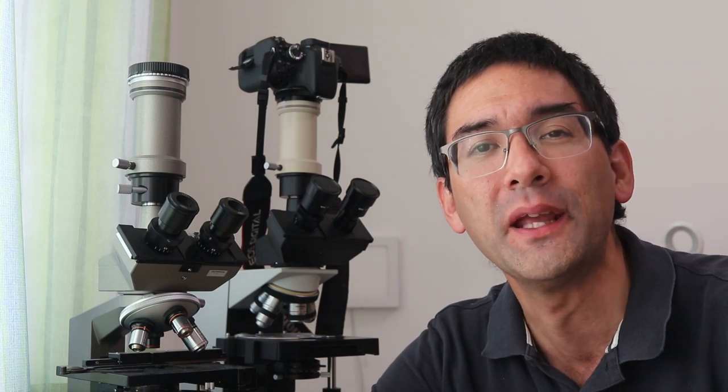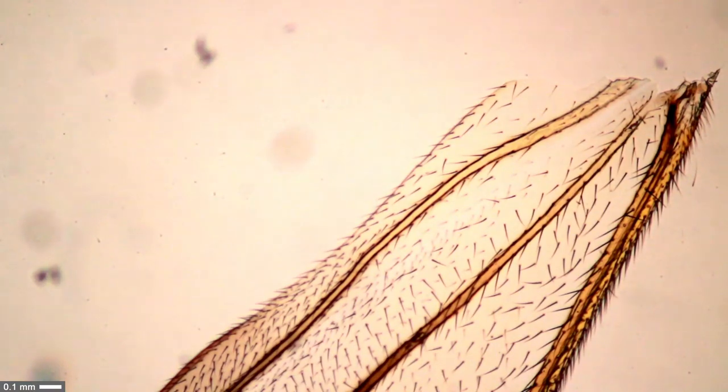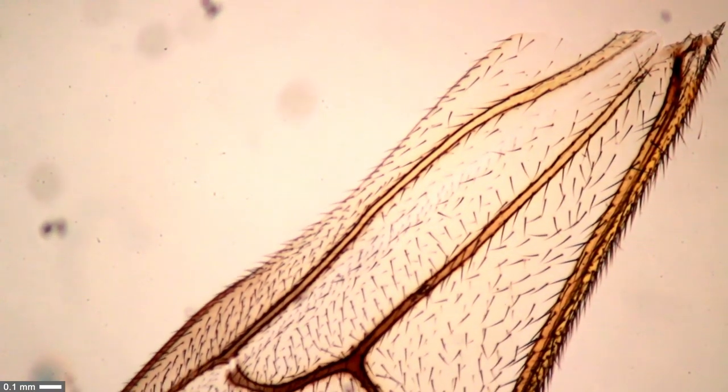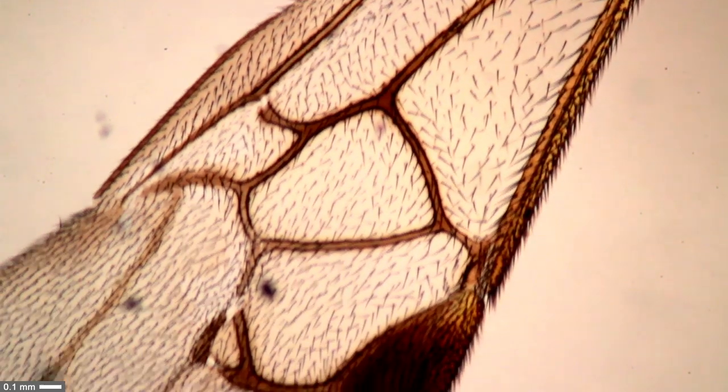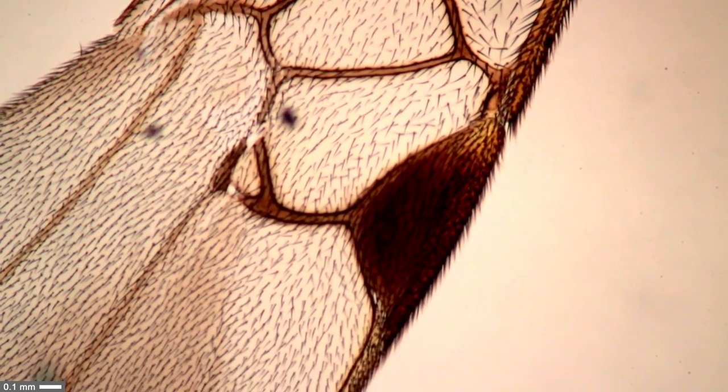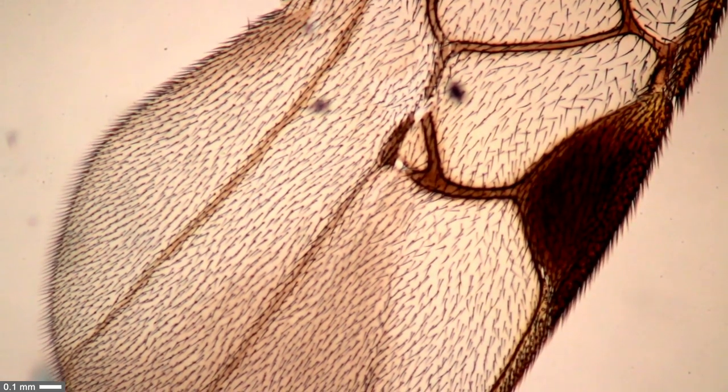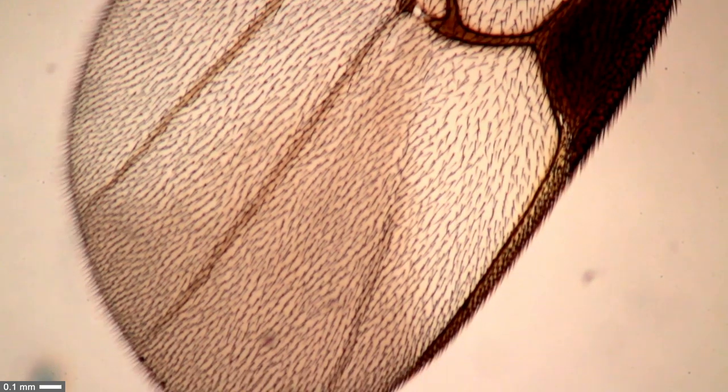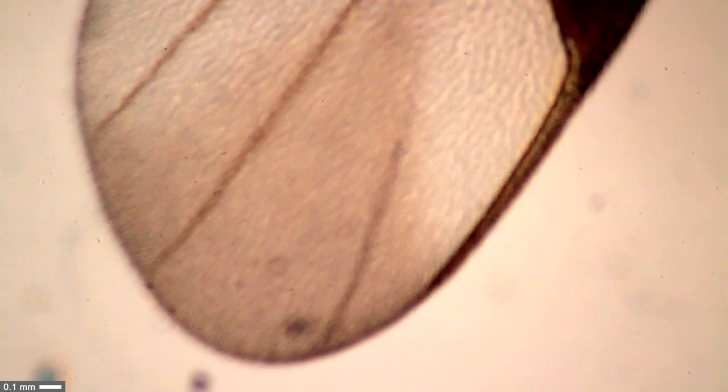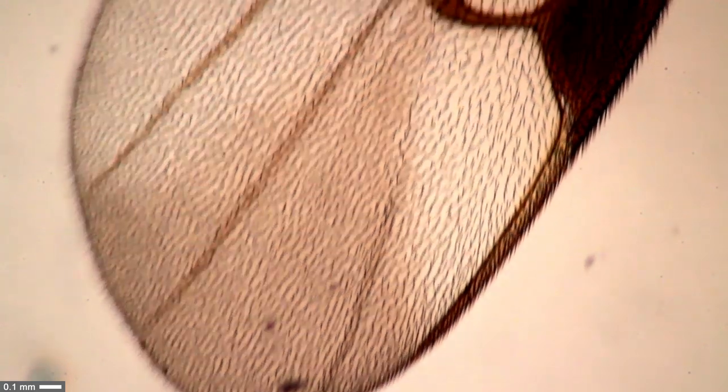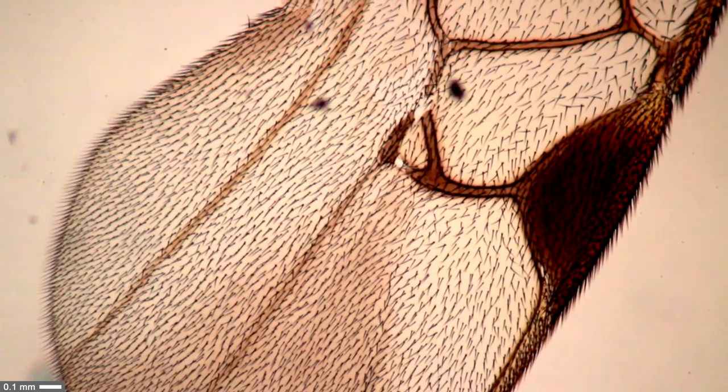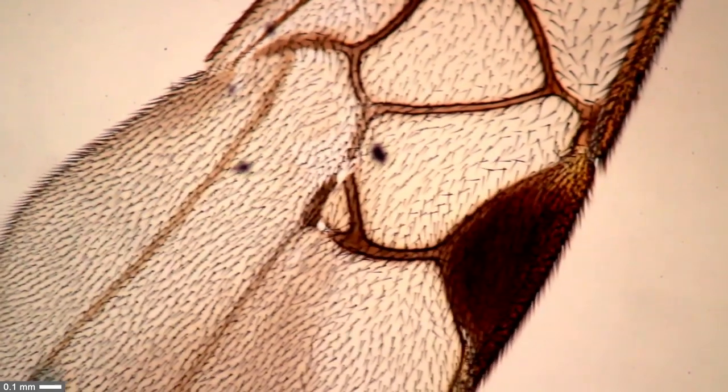Wasps belong to the Hymenoptera, which means they have two pairs of thin but fully developed wings. We're going to be looking at both the front wing and the back wing. Using the four times magnifying objective, the first thing I realized - a lot of hair on the wing. Both top and bottom of the wing have many little hairs. The second thing you realize, on the right side there's a large black spot called the stigma of the wing, which is important for identifying the insect.